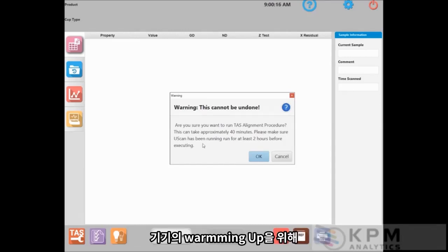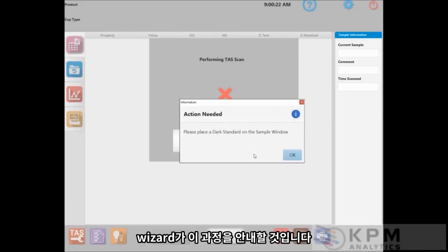Okay, so it says, please make sure UScan has been running at least 2 hours to be warmed up. We'll click OK, and a wizard will lead us through this procedure. So we're going to run all 3 standards for the TAS alignment procedure, starting with the dark standard.